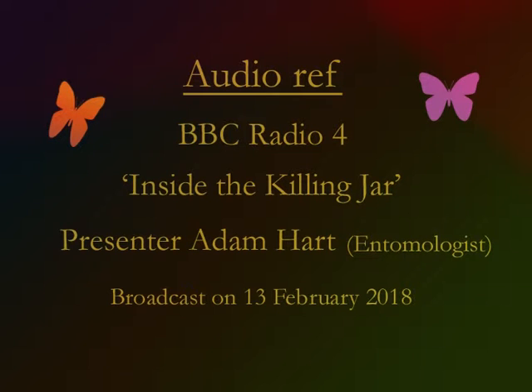In here I've got a jar — this is called a killing jar. It's got it labelled 'killing jar.' At the bottom of it I've got Plaster of Paris, because it absorbs the liquid that I put in there while it turns into a gas. This is our killing fluid. I only need a tiny drop of this in there, and this is sealed — it's airtight.